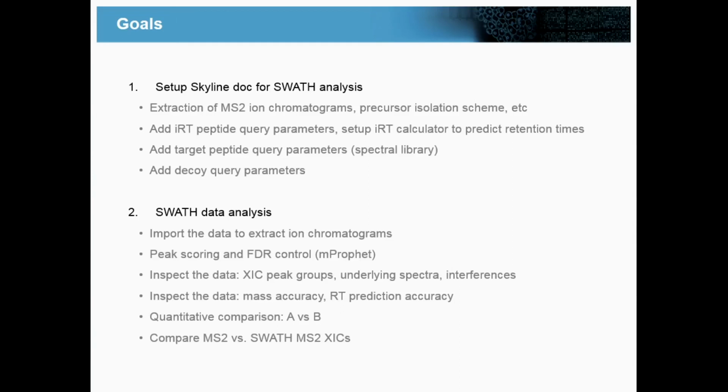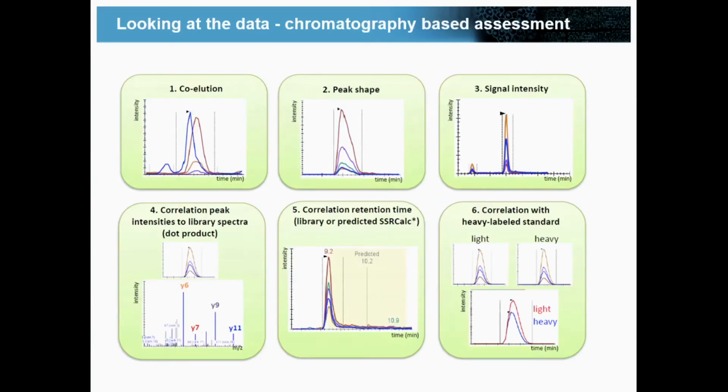And finally, maybe take a quick look. Oops, this should say MS1. So compare MS1 versus MS2 data to see if you can notice any difference about this. And so just to remind you what to watch out for when you're manually inspecting this data. You saw this slide, I think, from Tina already yesterday, and a version of this from Ludovic as well.